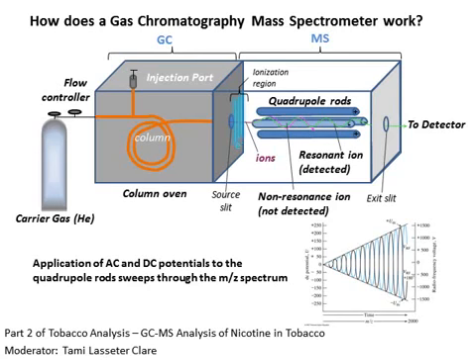Assuming that the resolution of your mass spectrometer is sufficiently high, we can then assume that one type of molecular ion gets through at any given point in time.